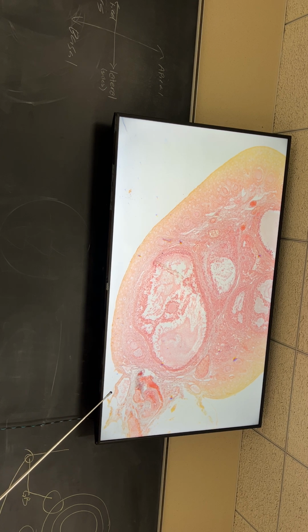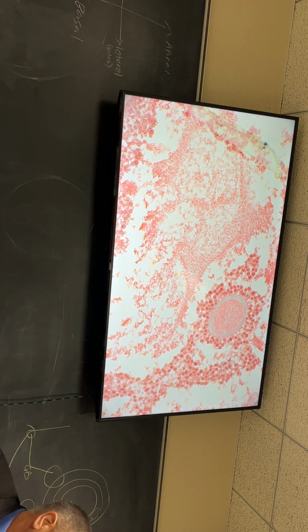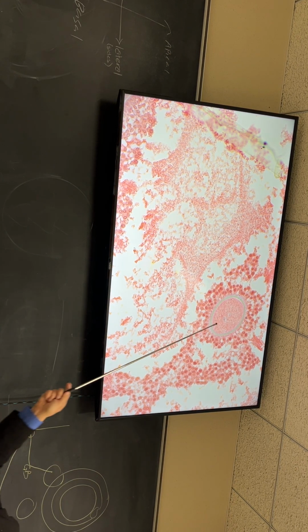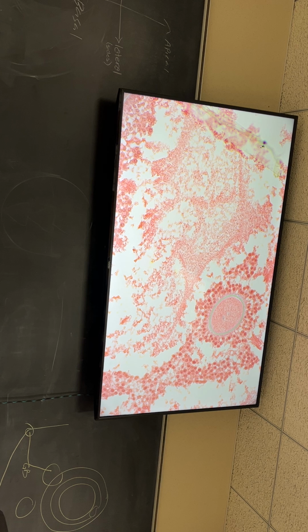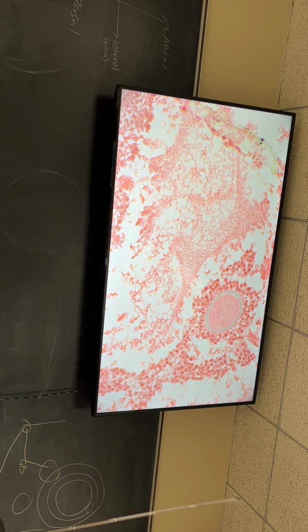All right, I'm assuming everybody knows what the primary oocyte is. I hope so. It's the functional part, right? Primary oocyte, right? Can't miss it. But then you have 2 other area things around it. You have the corona radiata and the cumulus oophorus.